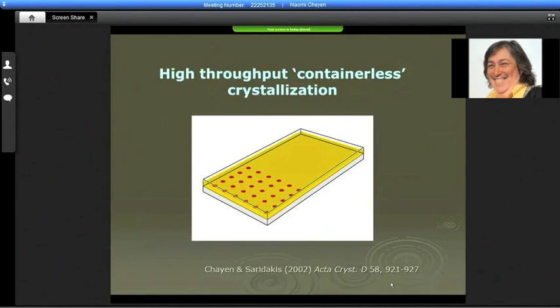Microbatch is very, very easy. It takes minutes, and anybody who's been to any workshop has seen it. And in most places, there are people who know how to do it. It's worth asking. It's really a question of minutes. Sometimes it's quicker to do a plate manually than by the robotics.